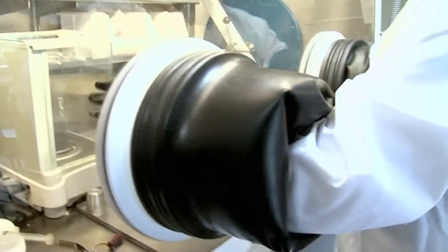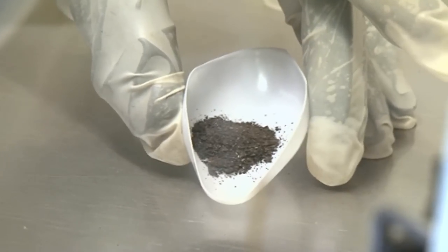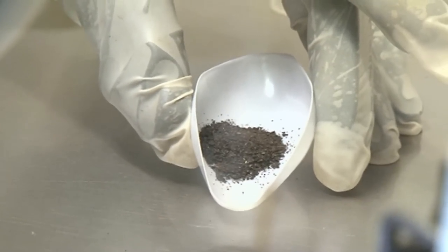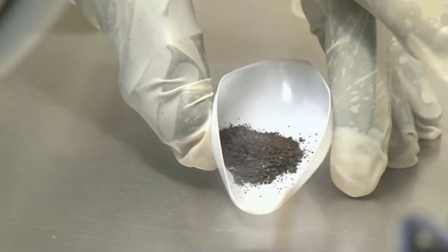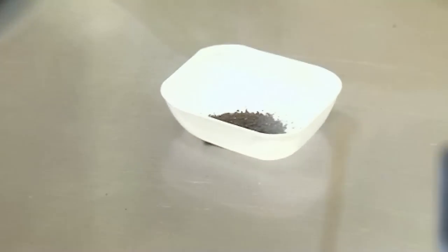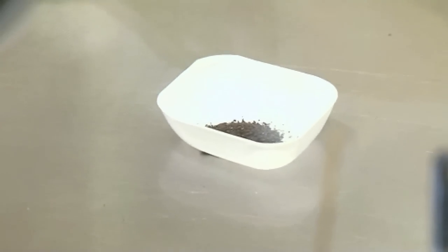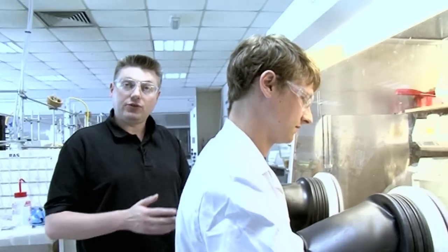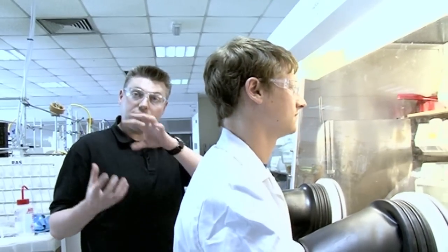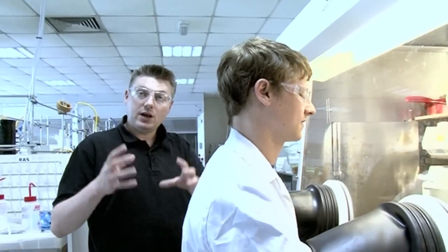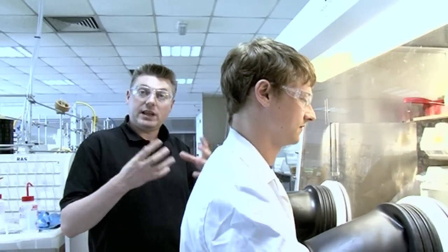And now he's going to show you actually it in the glove box. It's a real kind of dark red color, which is actually quite sensible because the uranium in this nitride, it's what we would call in oxidation state five. And uranium compounds with that oxidation state tend to be very darkly and intensely colored, often red. That's the final molecule. So that's the massive ligand with uranium and nitrogen in the middle. And then the sodium with two 12 crown four ethers as discrete pairs in a crystal lattice.